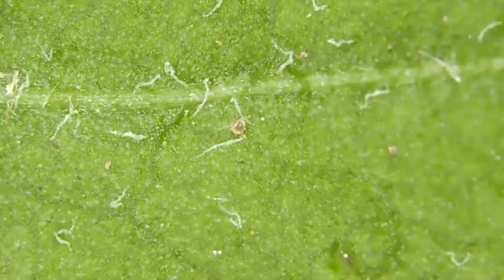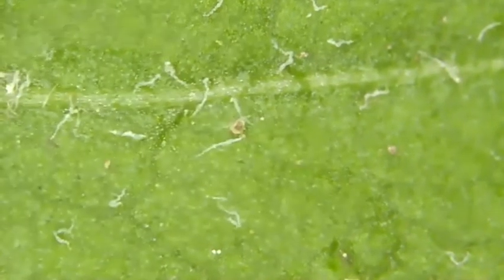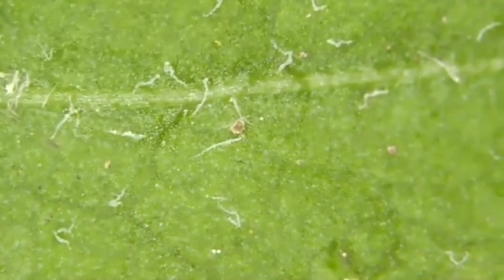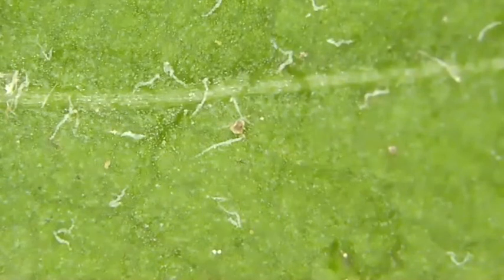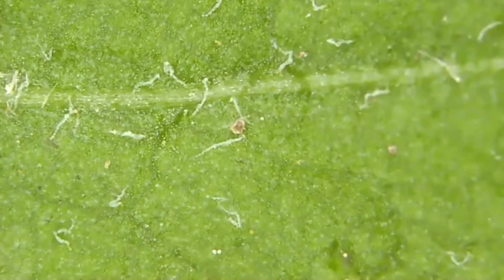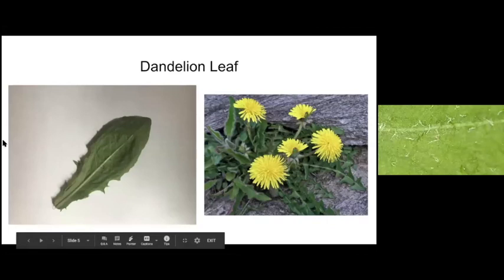From a leaf of a bean plant. Oh, yeah. Well, that is a good guess. Yeah, I actually don't know what a bean plant leaf looks like. So this is actually a leaf from a dandelion, but that's hard to be able to know. And then Lydia's gonna pull up the macro image.